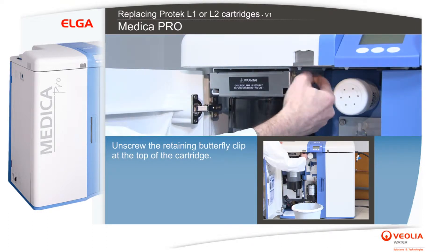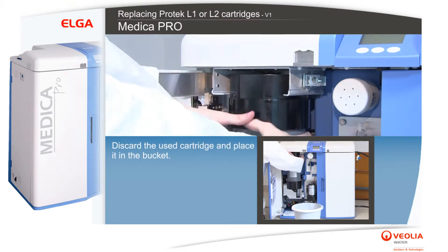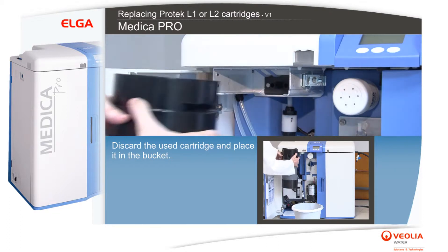Unscrew the retaining butterfly clip at the top of the cartridge. Discard the used cartridge and place it in the bucket.